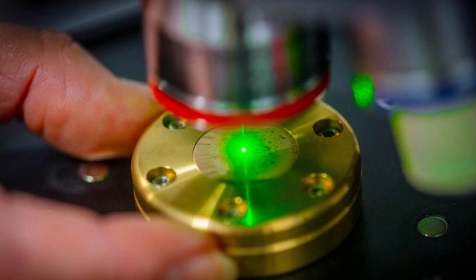To analyze plastic particles with a diameter greater than 1 micrometer, they must first be filtered out of the aqueous solution, detected under the microscope, and then illuminated with laser light. Because plastics such as polyethylene, polystyrene, and polyvinyl chloride scatter the photons in characteristic ways, they each generate signals as unique as a fingerprint.